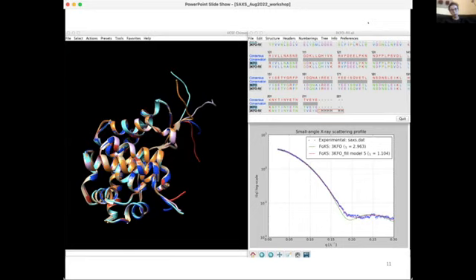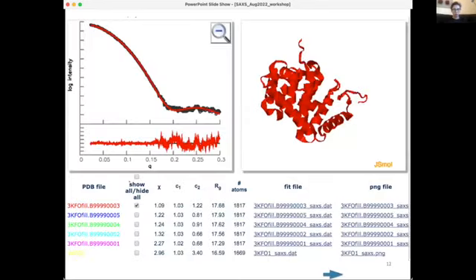Just install it. And if you go to the website of IMP, they also have notebooks. So if you like Colab notebooks, they have notebooks with FoXS as an example. So it's very easy to use in Colab as well. Okay, so I hope now you understand how important it is to add everything.